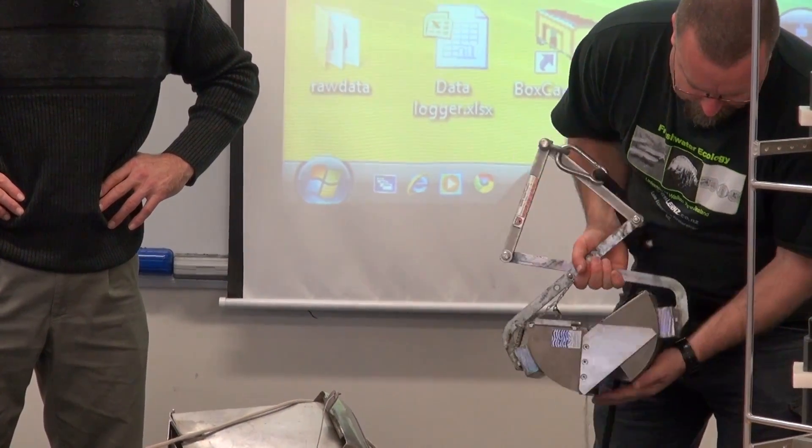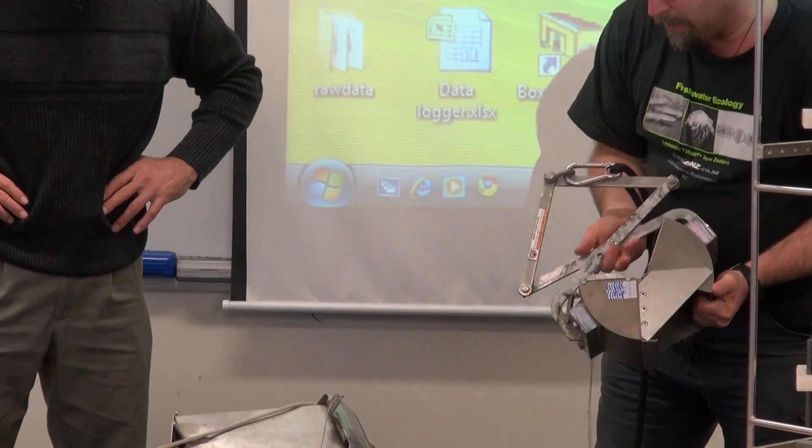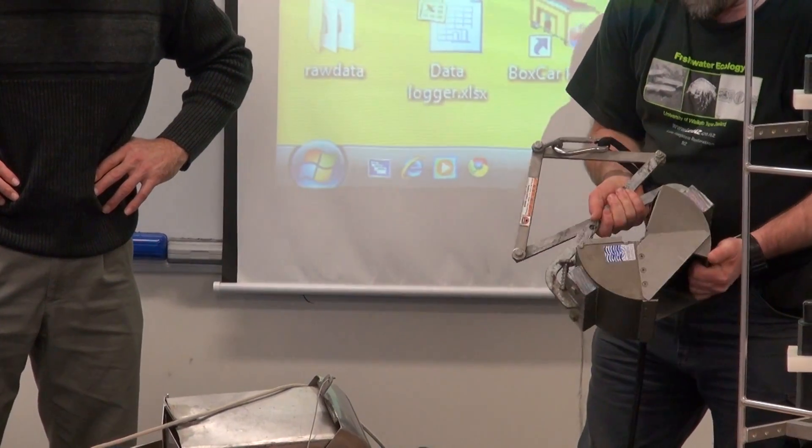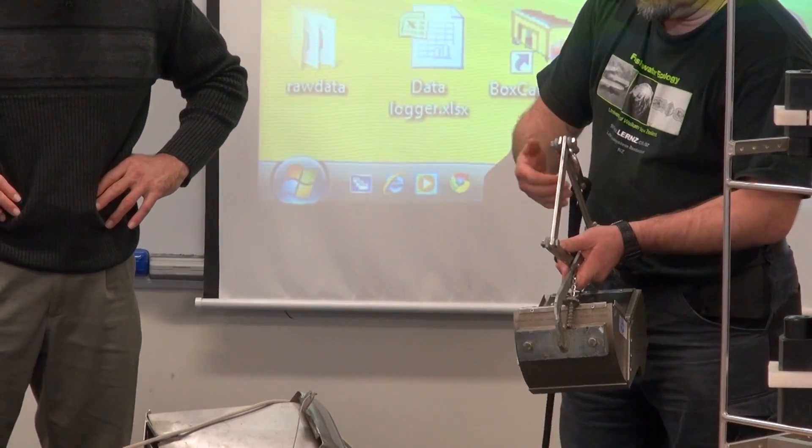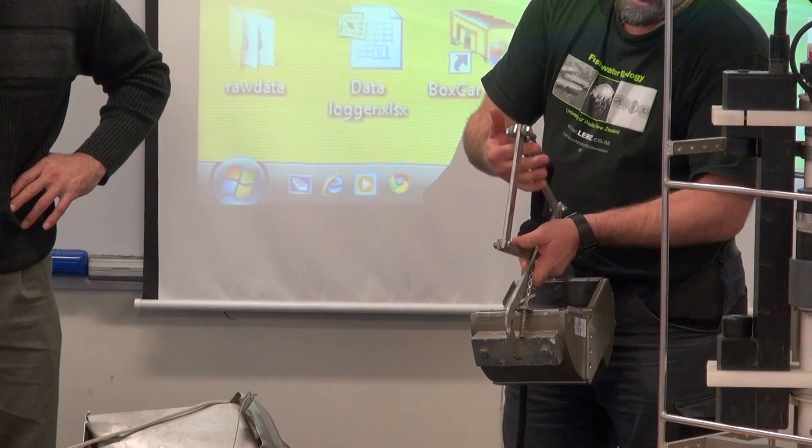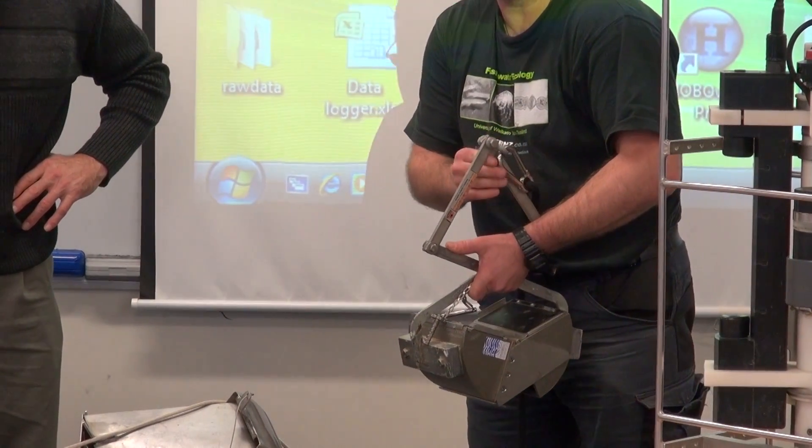Make sure you give it a good clean out once you're taking your sediment out of it. Also, when you're handling it, it can close up on your hands. It's very heavy. You can get your fingers trapped up in here, and that will hurt.